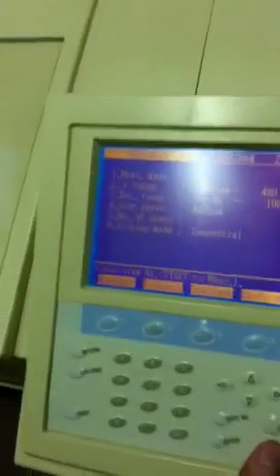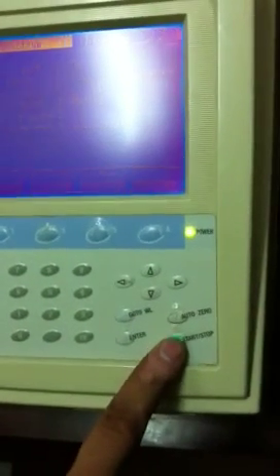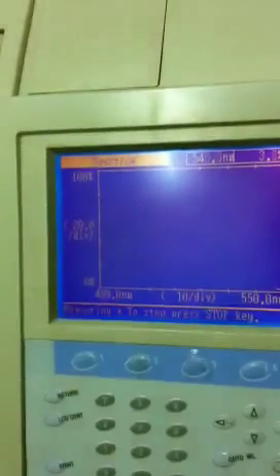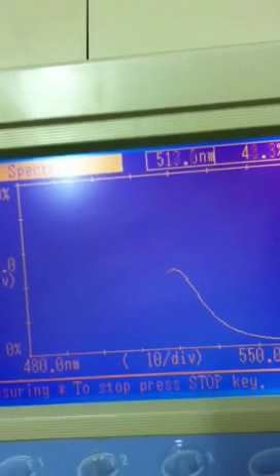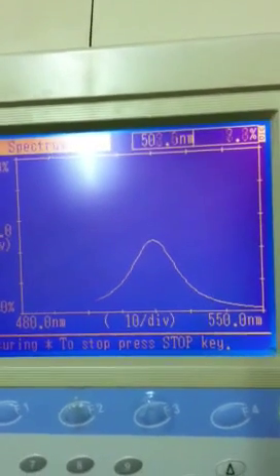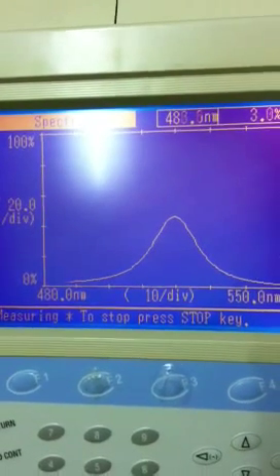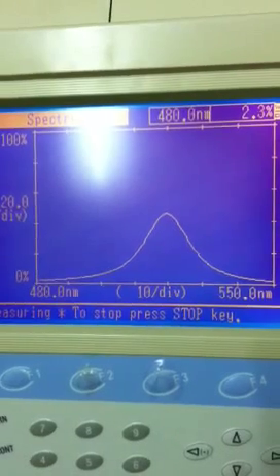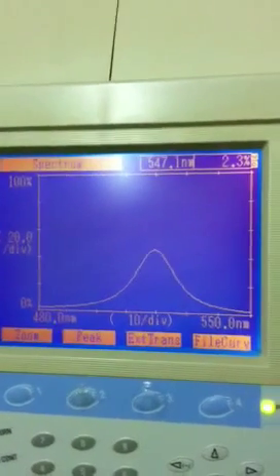We are going to place the standard, we have tested that. Now we have started the scanning and you can see the scanning. It has finished.